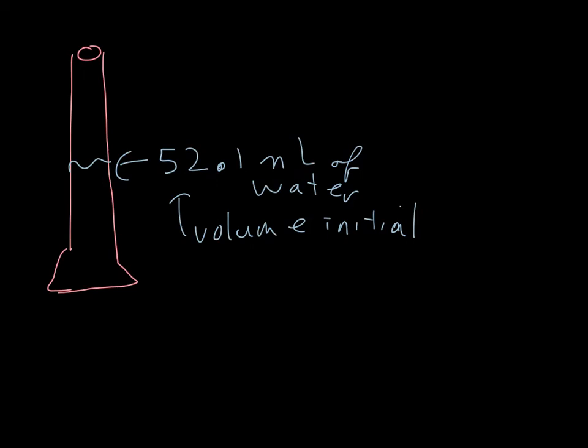Alright, so we take this object and we drop that object in the water. I take my object and I drop it in the water. Let's give our object a mass of 28.3 grams.